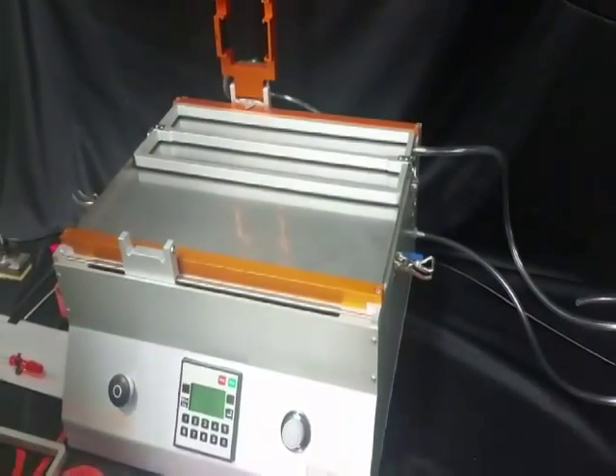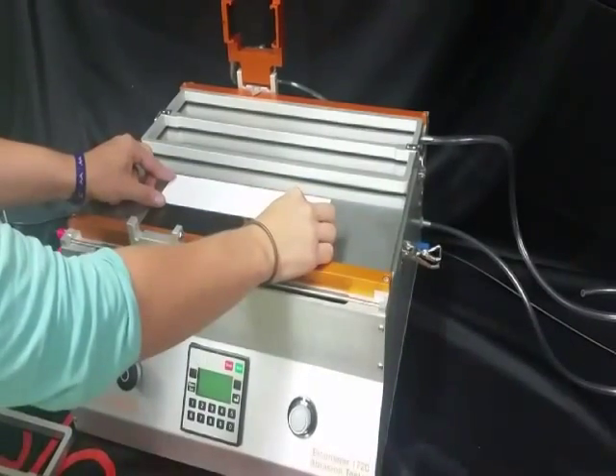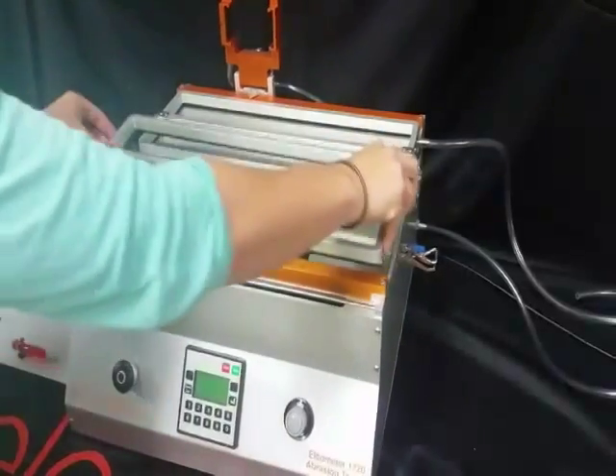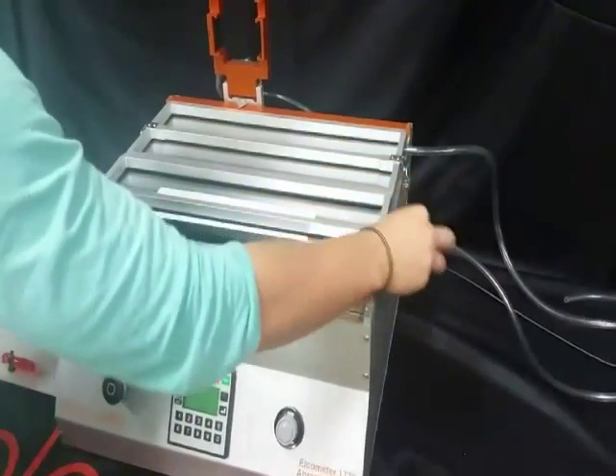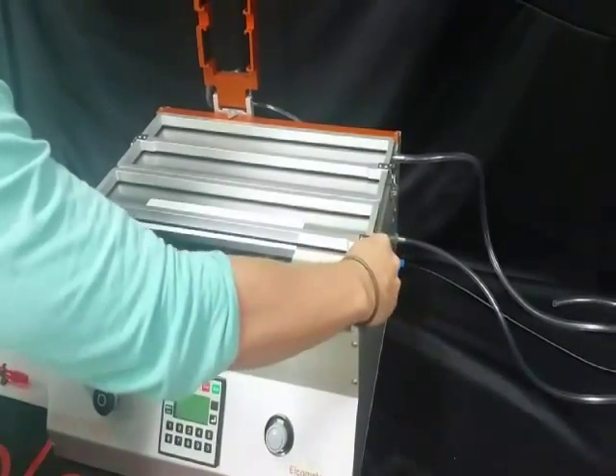In this demonstration, we are also using a sponge and abrasive tool number 5. The 1720 can undertake tests according to a wide range of different standards and test methods by simply changing out the abrasive tool.